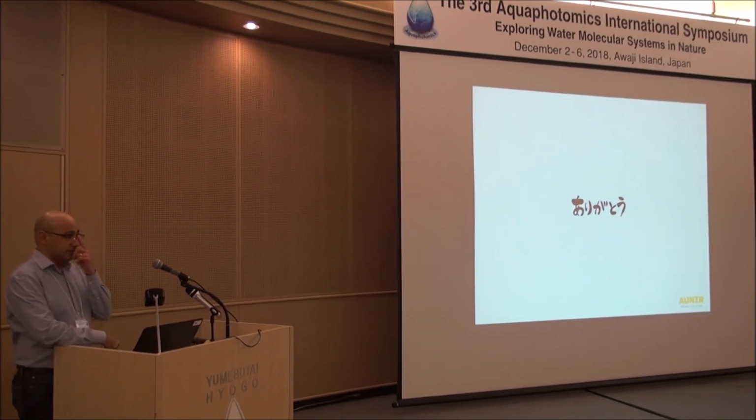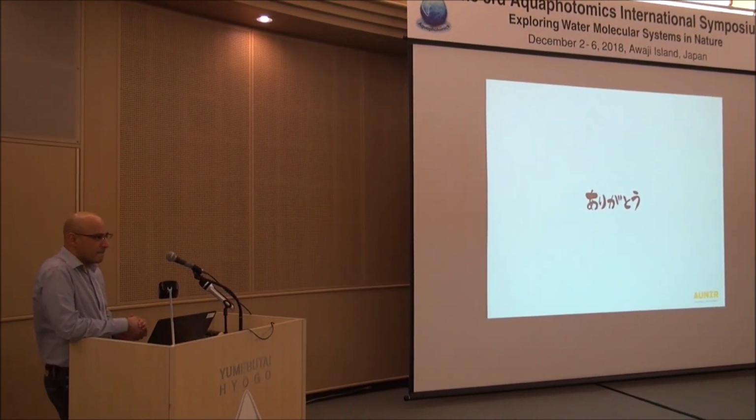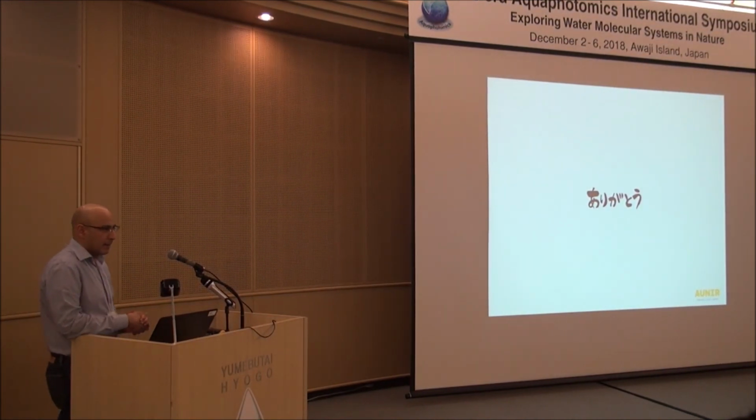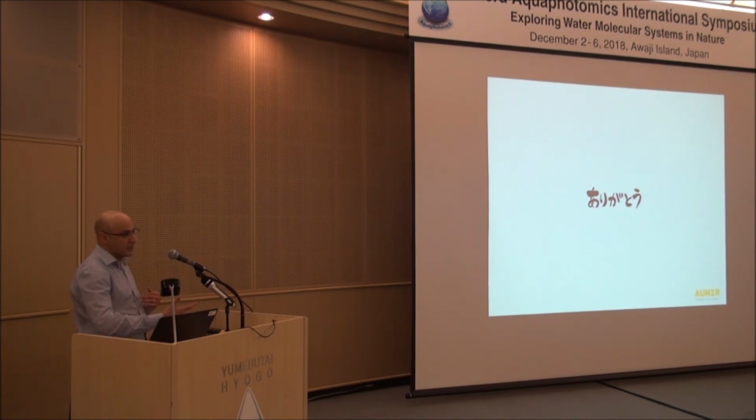Thank you for the presentation. In my opinion, it's a very powerful tool for data processing. Just to understand if I'm correct, the advantage of this application is when the perturbation that you have is not constant. Because if I have something that is disturbing my acquisition, but I can keep it constant, maybe only block scaling can help me. But in this case, the perturbation can be out of control. Am I right? Yes, the main idea is to define the direction of perturbation. And for that, we need to change that perturbation, so it shouldn't be constant. So you have to change it so you can identify the direction of perturbation and then subtract it.